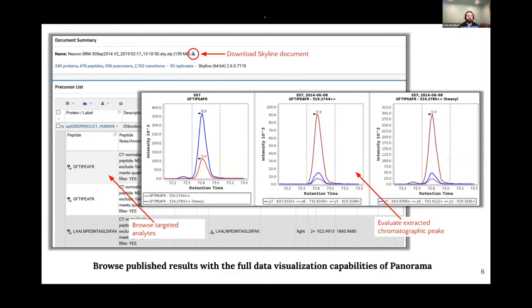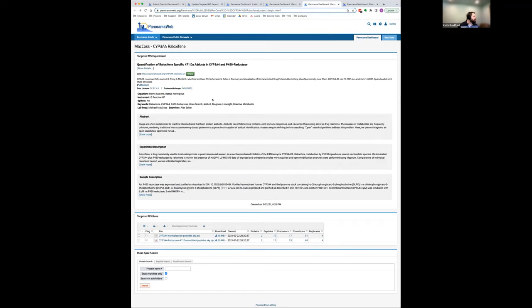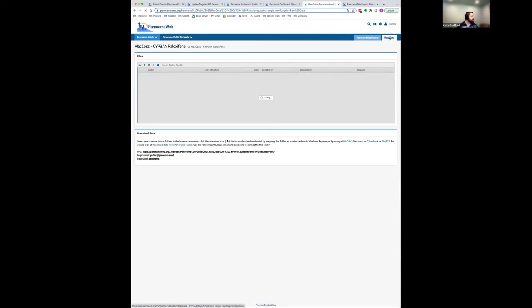I did want to share just really quickly, I saw that there were some questions about raw data being available. So just to show an example of a project that is now available. This is the generic where you've just filled in the required fields. Raw data is available in this upper right tab over here to be downloaded and used.